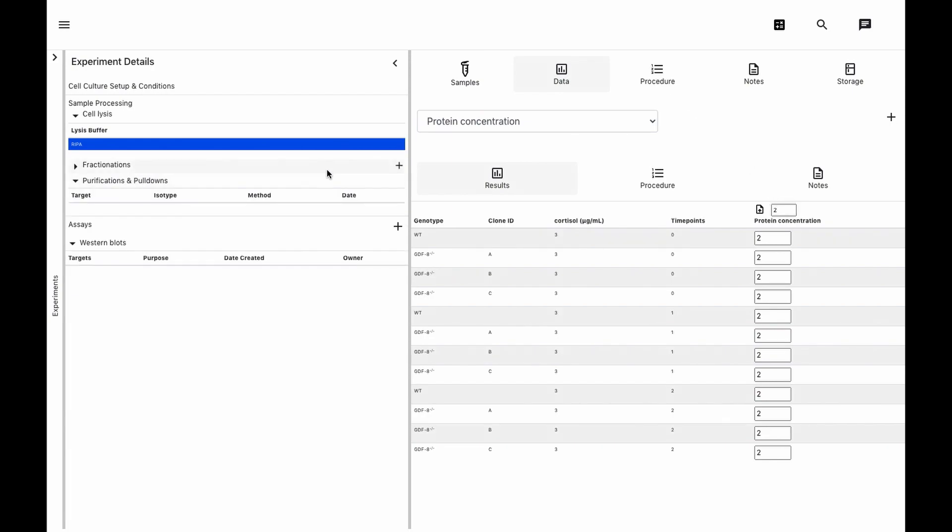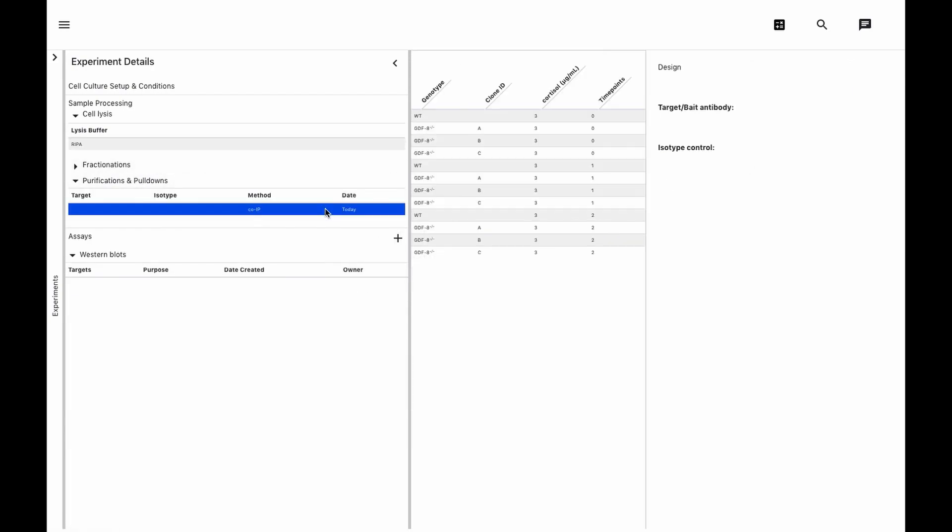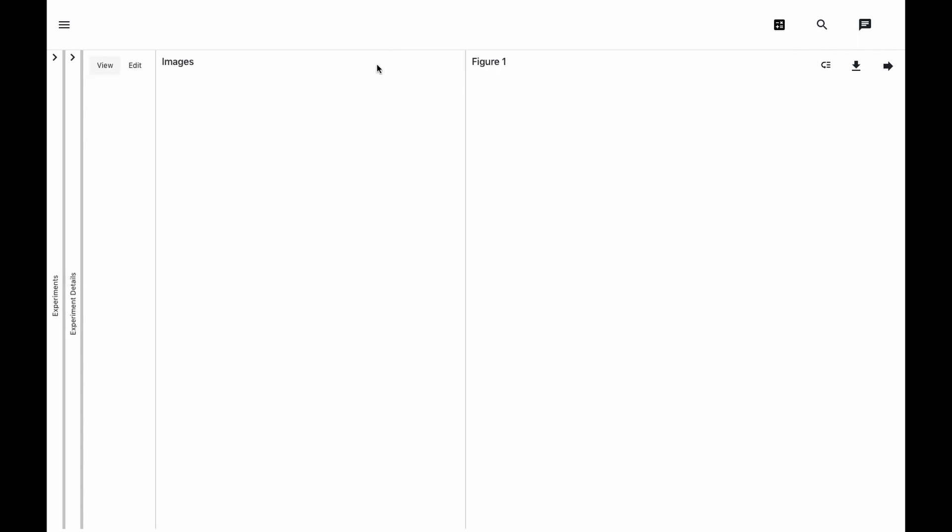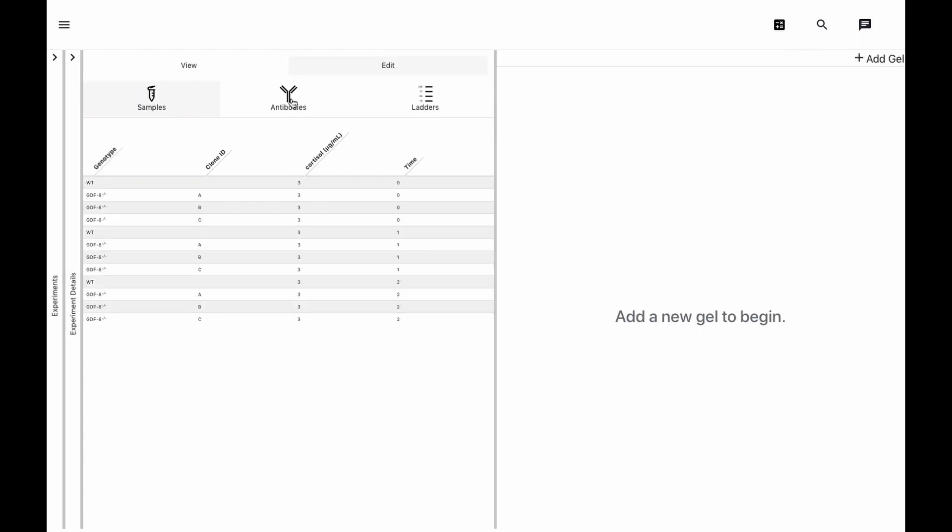If we're doing purifications, we just add one here and select which samples will undergo that process. But today we're focusing on the standard western blot, so we'll create one and make some more space.